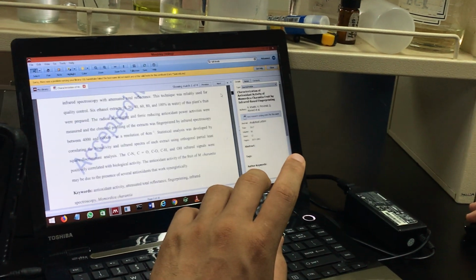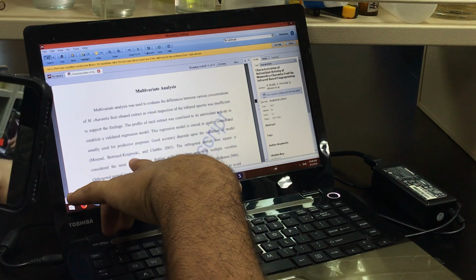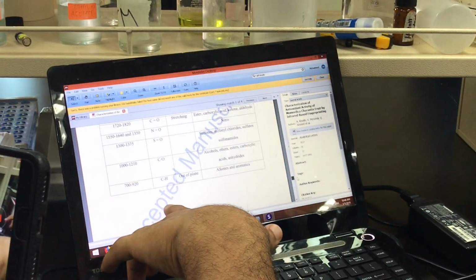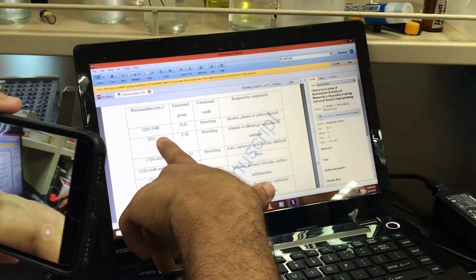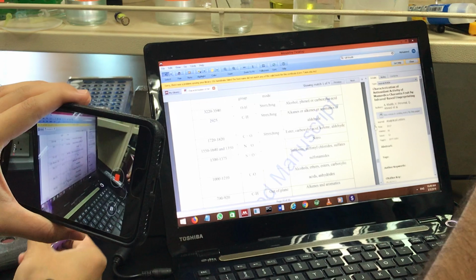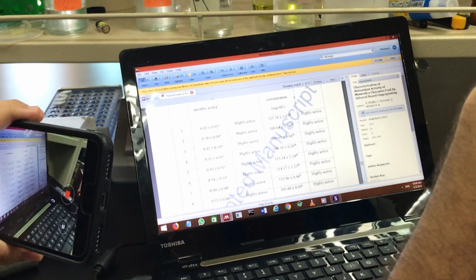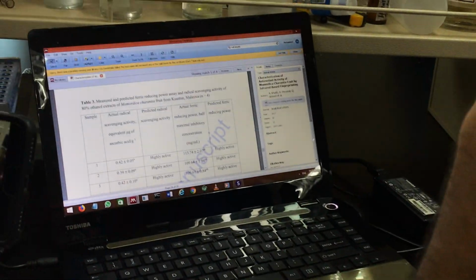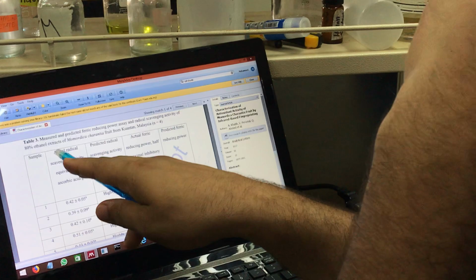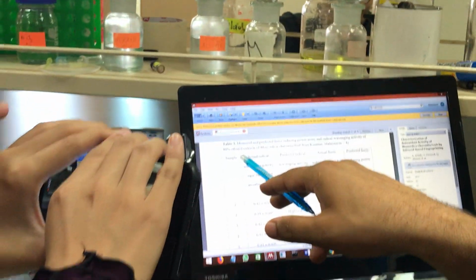I think you can go through this paper also. This is about antioxidants, also FTIR. You can see here, this is the grouping. This FTIR is for quality control. You can see here, this is okay. And for this plant, 80% ethanol was the higher activity.